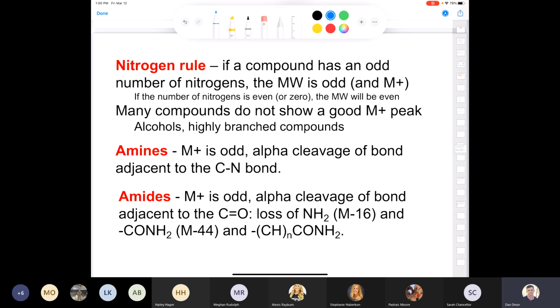So, the nitrogen rule. Usually my students are pretty astute on the nitrogen rule by the time they finish this assignment. On every mass spectrum that is in this assignment, you should always refer to the nitrogen rule. By that, I mean, if the molecular ion is even, you say no nitrogen present or an even number of nitrogens. If the molecular ion has an odd mass, I want you to unequivocally state there is an odd number of nitrogens, 1, 3, 5, etc. Be sure to include the nitrogen rule.